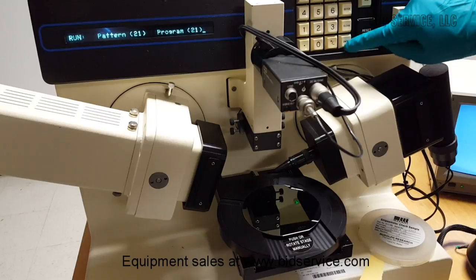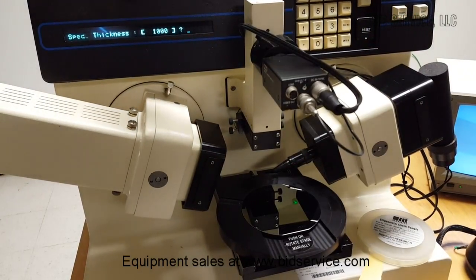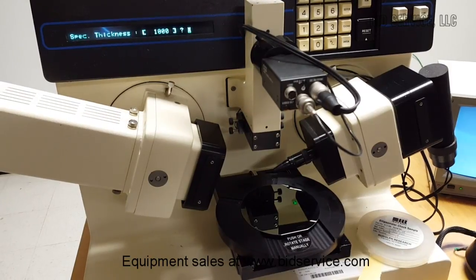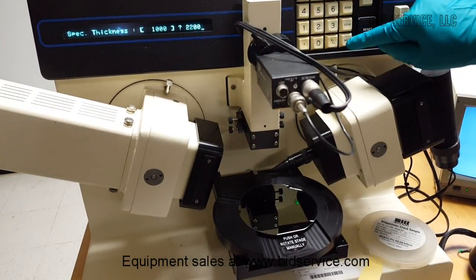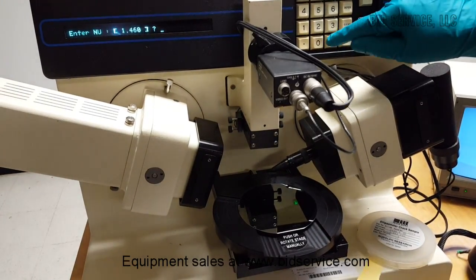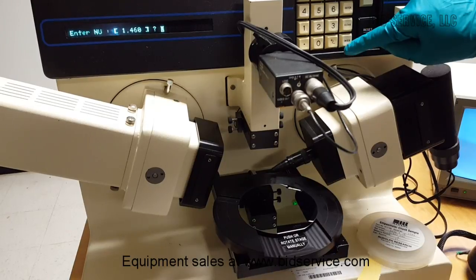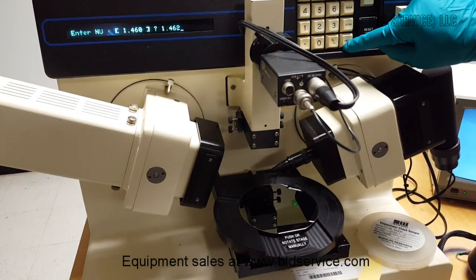In this case, the system will prompt for the approximate thickness of the wafer. I'm entering it as 2200, and then the refractive index of the layer, which is 1.462. I'm going to enter it.